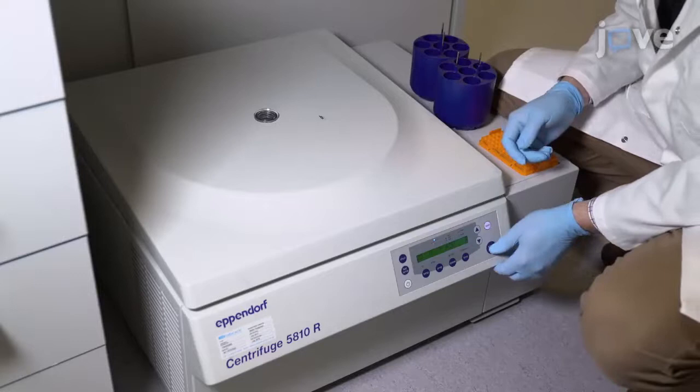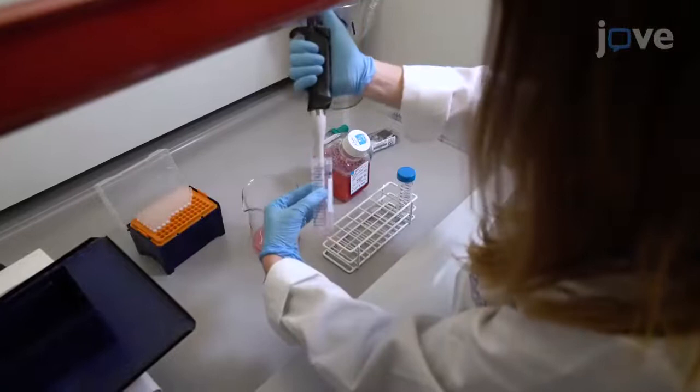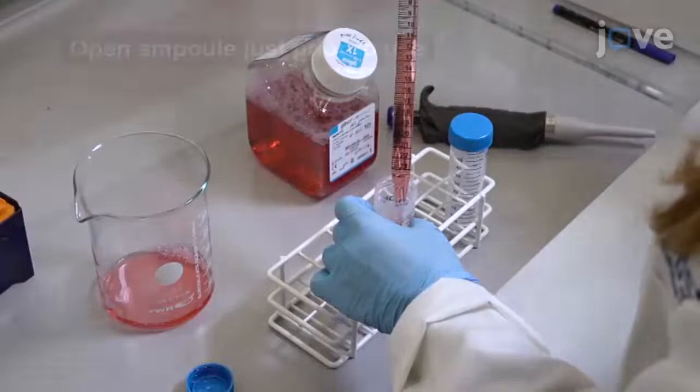Start with a minimum of 20 million cells per experiment. For suspension cells, collect and centrifuge cells at 400 times G and 20 degrees Celsius for 3 minutes. Remove the supernatant and resuspend the cell pellet in 30.625 milliliters of medium with 10% FPS at room temperature.